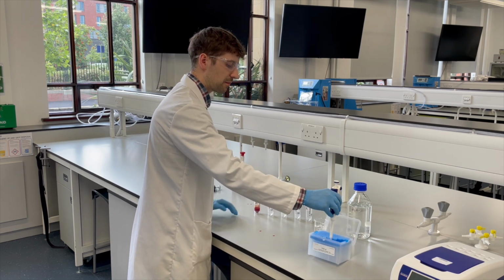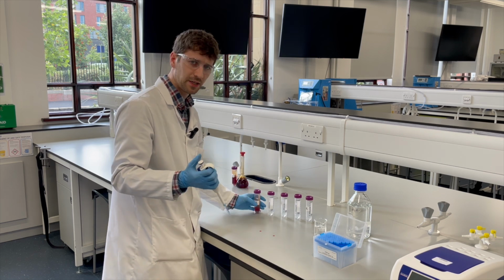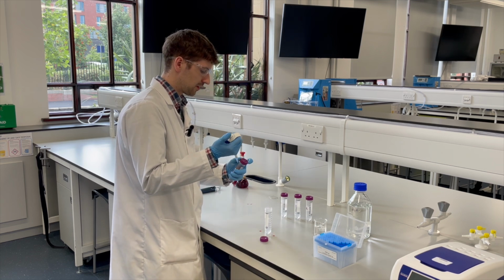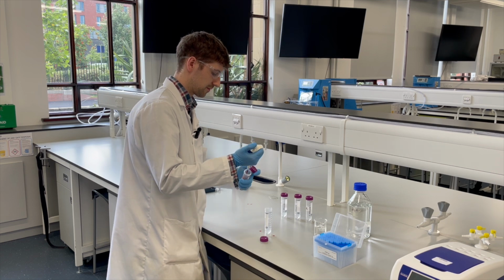I get a fresh pipette tip, right? Remember, fresh pipette tip every time. We've obviously just contaminated our pipette tip with really concentrated stock. So, fresh pipette tip, and again, from this new vessel, 4 mils.